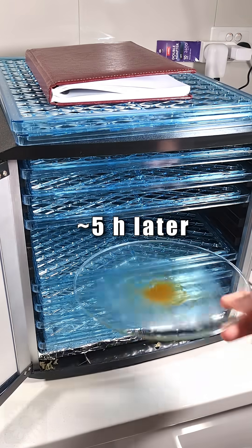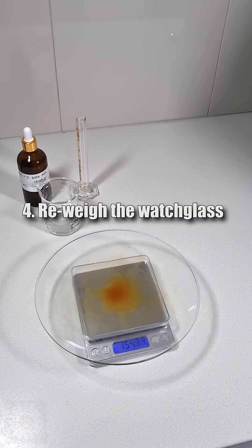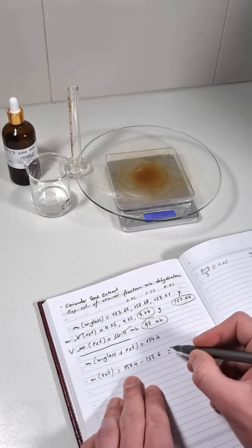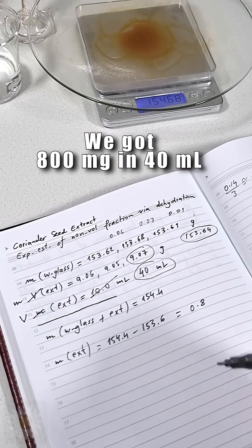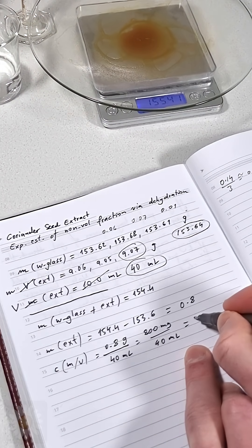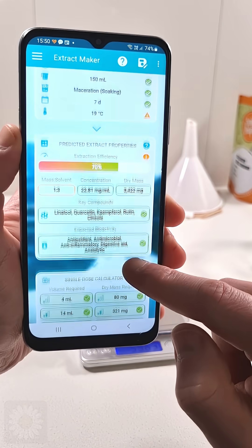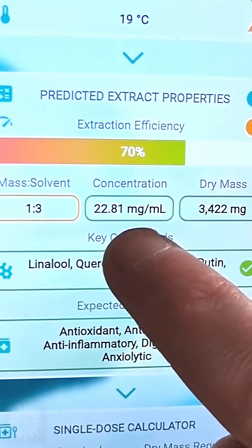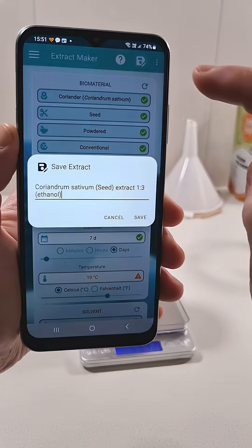Finally, check that the residue is fully dry, re-weigh the watch glass as before, and then subtract the initial mass from the final mass. Our test gave about 800 milligrams of residue from 40 milliliters of the tincture, which is about 20 milligrams of coriander per 1 milliliter. Taking into account the uncertainty, the Extract Maker app's prediction of about 23 milligrams per milliliter was spot on.